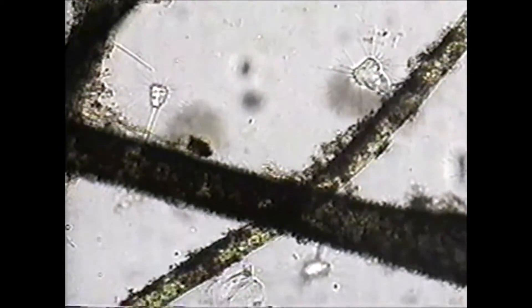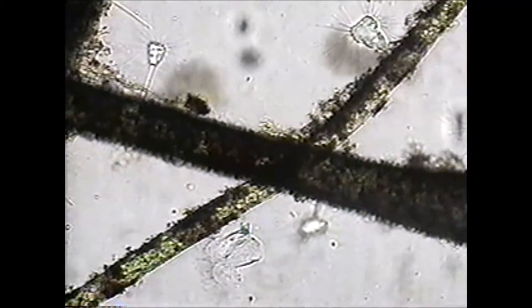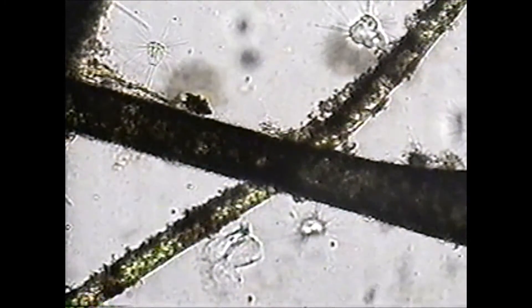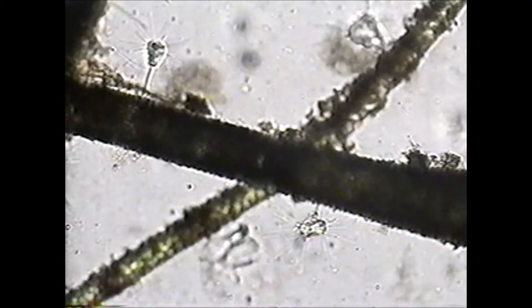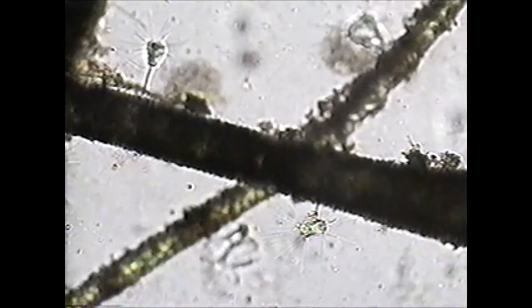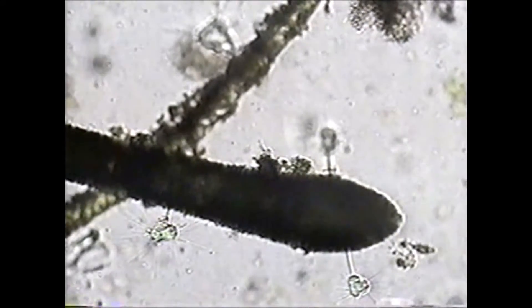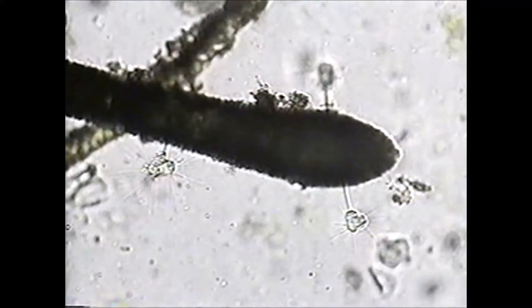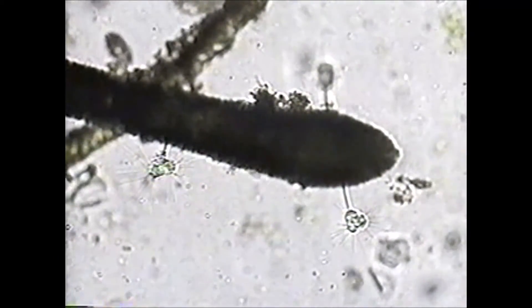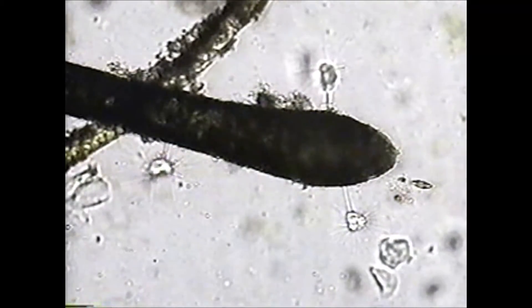Suctorians, a ciliate protozoan. The adults, however, have no cilia or cytostome. They do have a non-contractile stock used to attach to the substrate. Suctorians have no mouth.